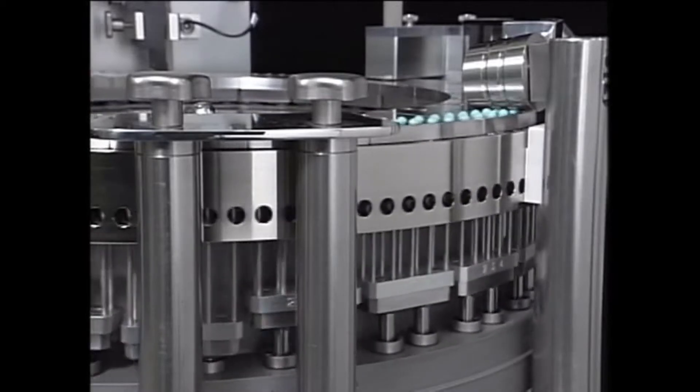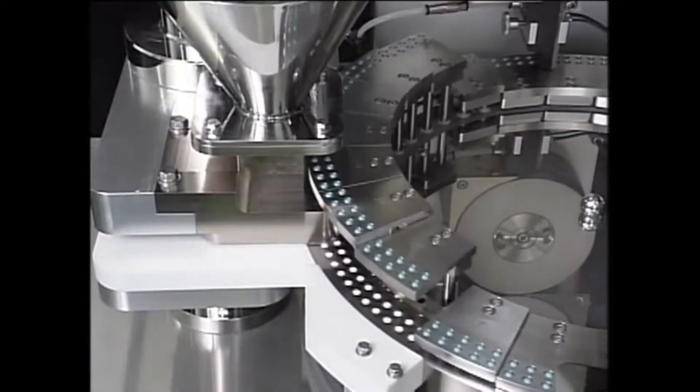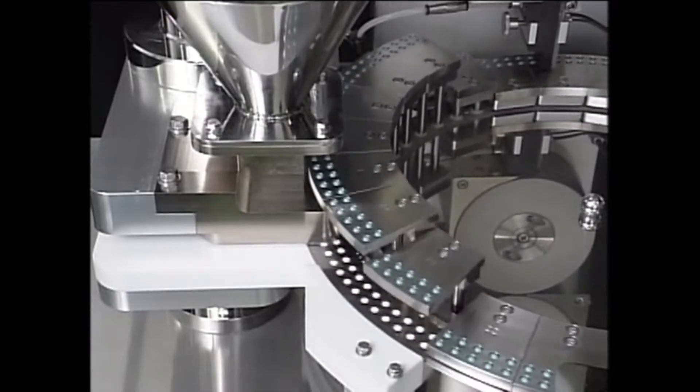This fully automatic capsule filler, the JCF40, makes it possible to fill the various kinds of drug products that are being developed nowadays. QualiCaps will continue to comply with the various needs of pharmaceutical companies.